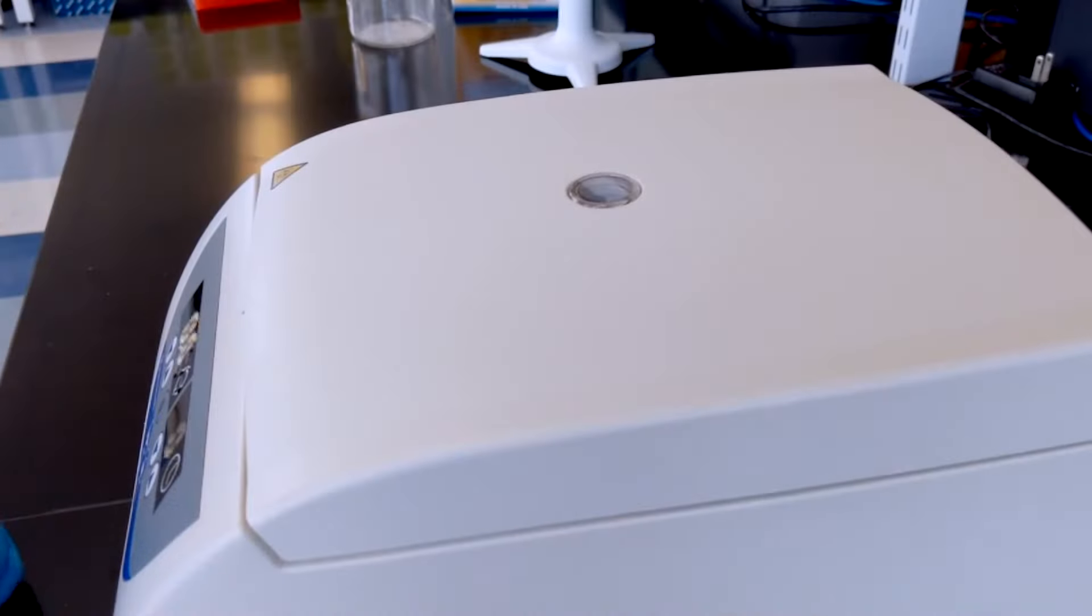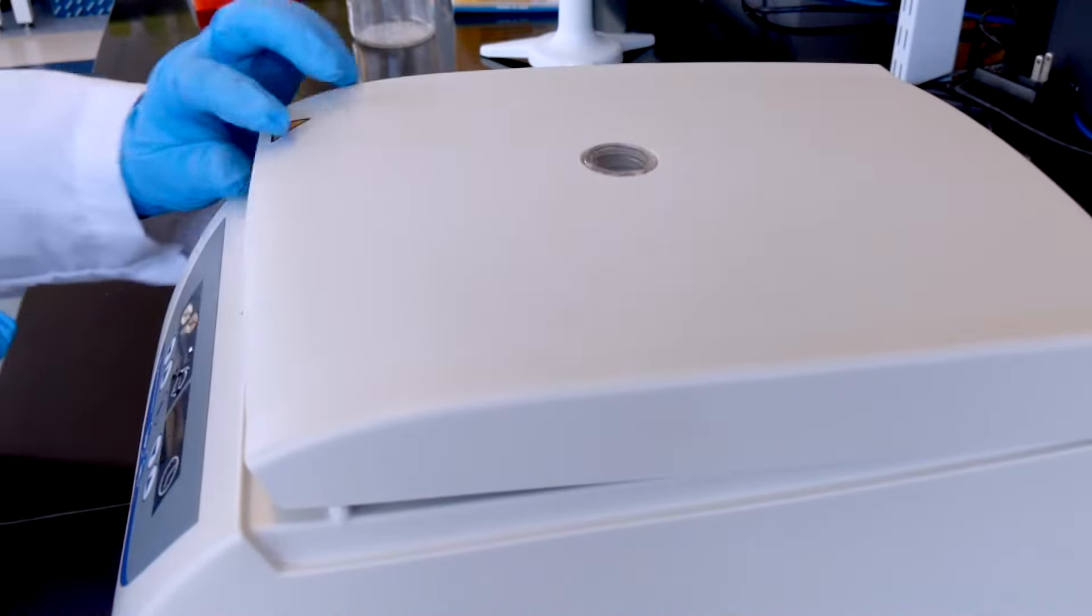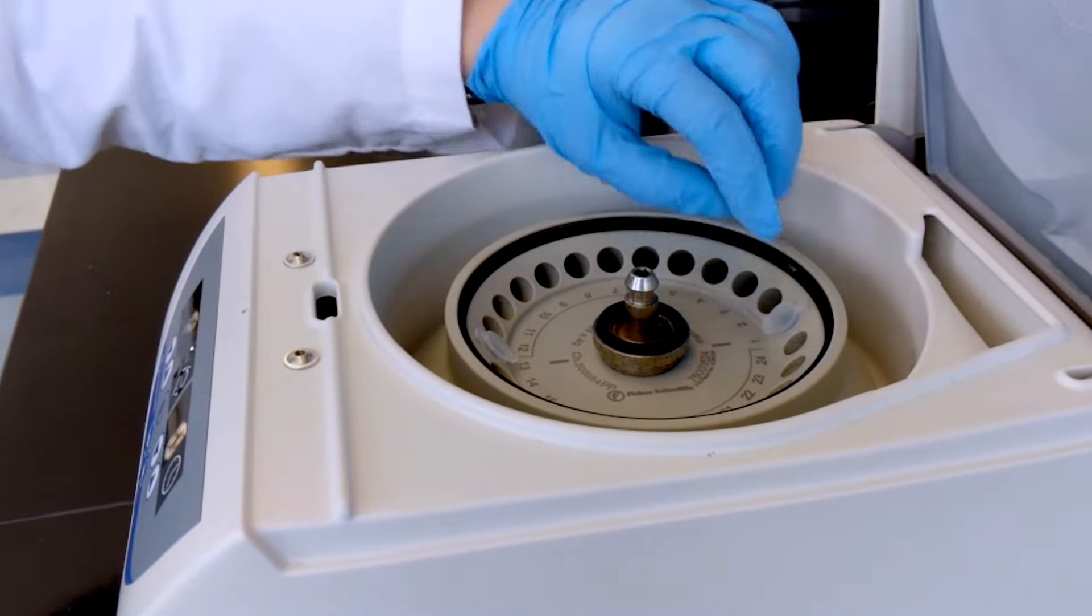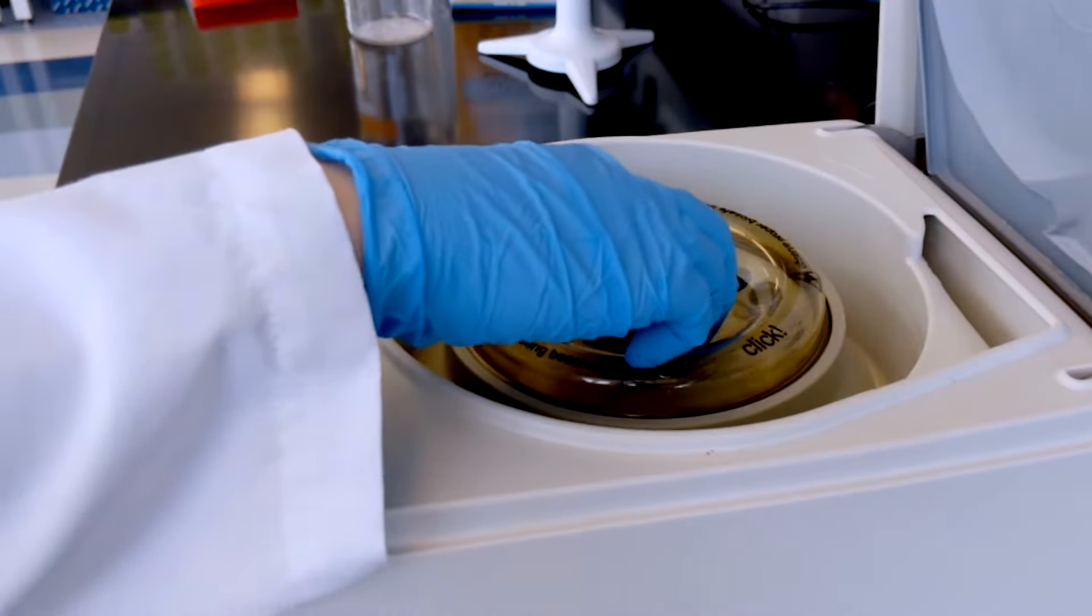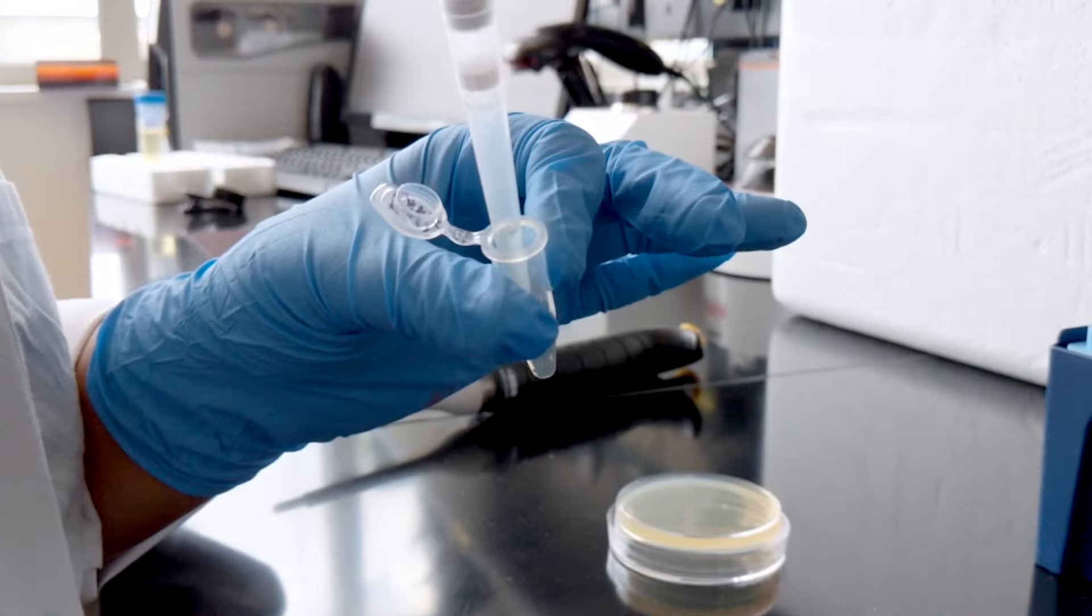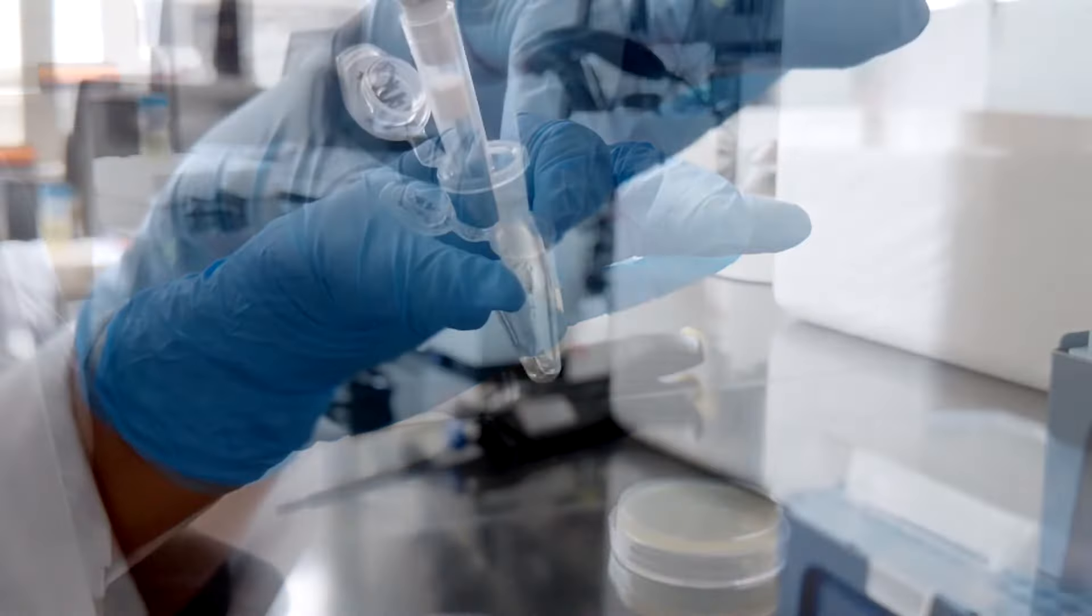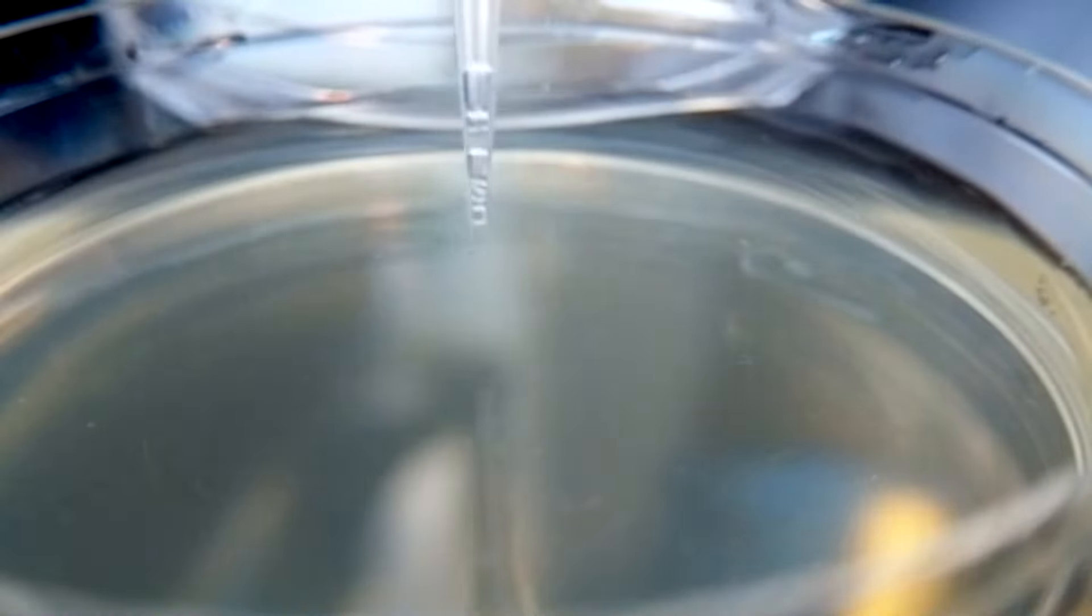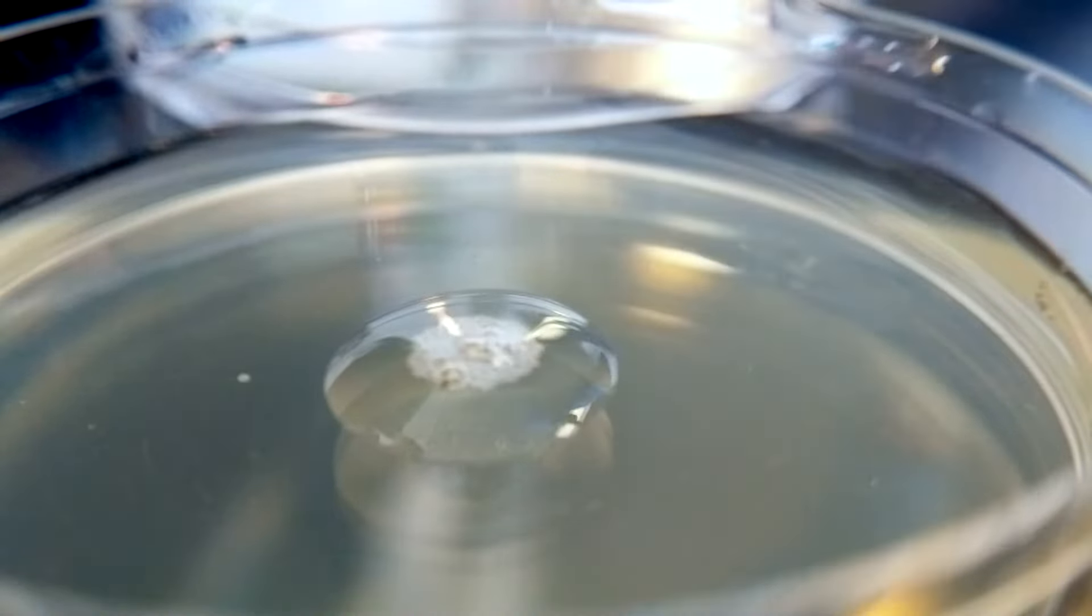To increase the number of colonies you get after plating, you can concentrate your cells after the outgrowth step by centrifuging. We usually centrifuge the cells for 5 minutes at 4000 RPM or 1500 Gs. After you've removed some of the supernatant, you can re-suspend the cells and pipette them on top of a warmed LB agar plate containing the necessary antibiotic.